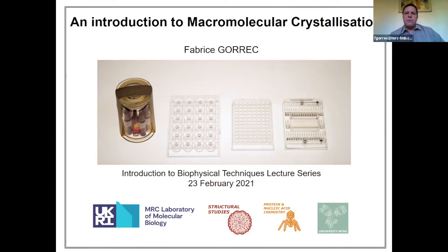is what is now called SBS format plates, and it represents the automated approach. Now the scale is 100 nanoliter drops, and on the far right is a microfluidic chip, where the experiment scale is on the order of 1 nanoliter. So this was just a little overview. We're going to go back to miniaturization of experiments later, but I like this picture. It represents the evolution of the size of the experiments through time.